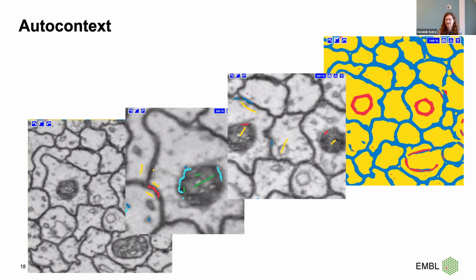But of course this comes at some cost, because you usually have to compute much more. If you, for example, want to do this in 3D, I would say you shouldn't even start without having 64 gigabytes of RAM. Yeah. But looking at this image, this is still not perfect, right? You can see there are pixels here and there that should not be there in a clean result.